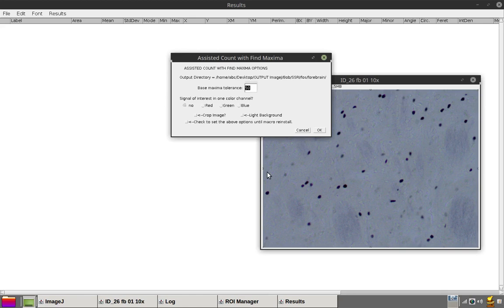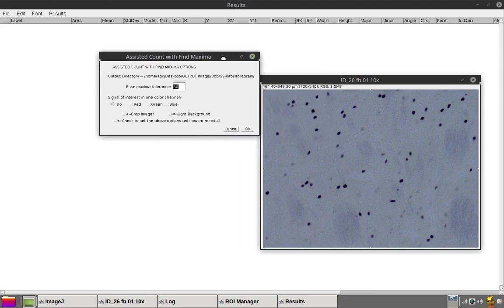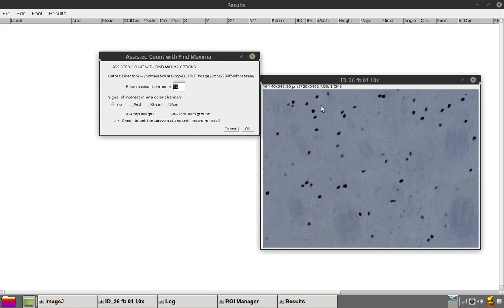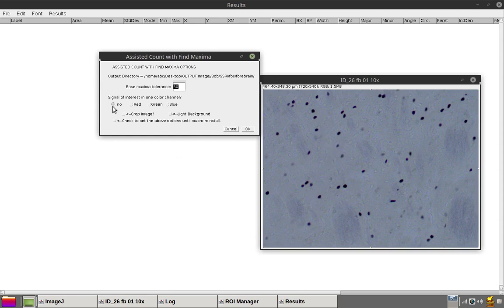The assisted point count prompt appears. Confirm that the user output folder is correct. Since this is a non-fluorescence image with no discernible color separation, let's choose No for signal of interest.